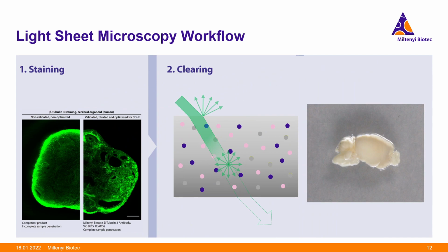The next consideration is tissue clearing, which I believe you guys have heard me talk a lot about at the beginning of this talk. If we consider normal, live, or fixed tissue, there are many different materials within the tissue, such as water, proteins, and lipids, that really impair the light passage. As seen in this simplified view of tissue, these materials that the light encounters cause things like reflection, refraction, scattering, and absorption, and decrease the light penetration, detection, and then ultimately the image quality.